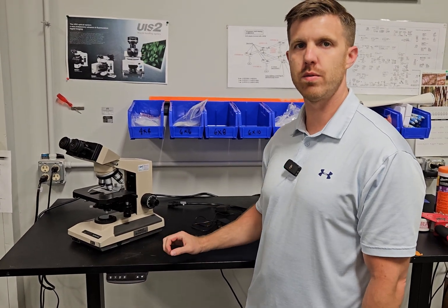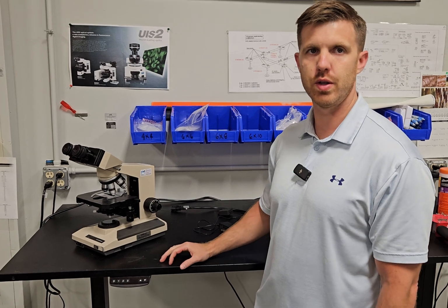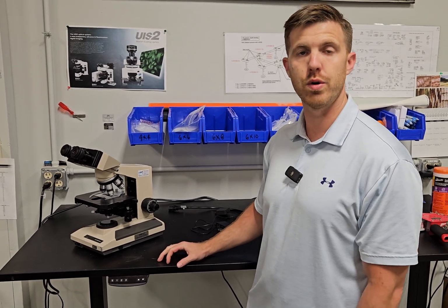Hey, this is Chad with Monday Scientific. Today we're going to talk about the Olympus BH2 and what happens when your light doesn't work any longer or you want to upgrade to LED.